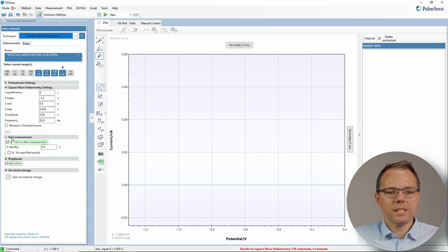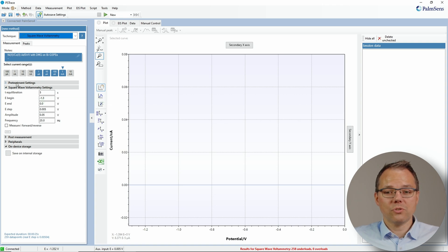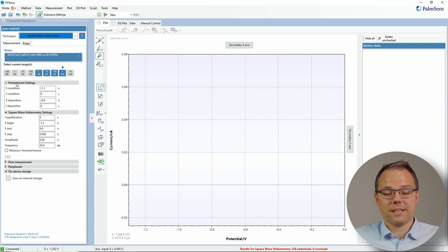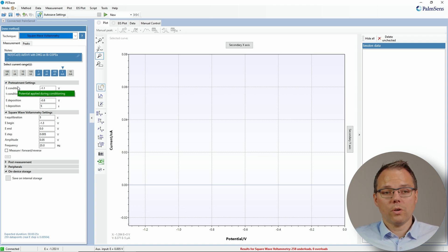If you reduce the extra parts, this looks exactly like a normal square wave voltammetry measurement. You put your settings in for the stripping step as usual. The extra thing you do is go into the pre-treatment settings, because for stripping you need to apply a deposition potential to first get your electrode dressed. It's also common to apply a conditioning potential to strip off old remains from the electrode or reduce the surface to get it back to an initial state.